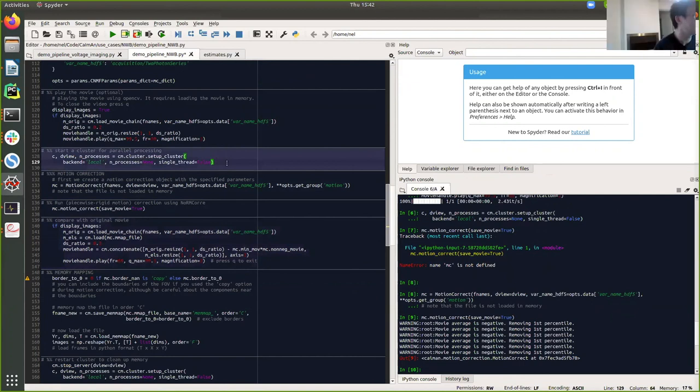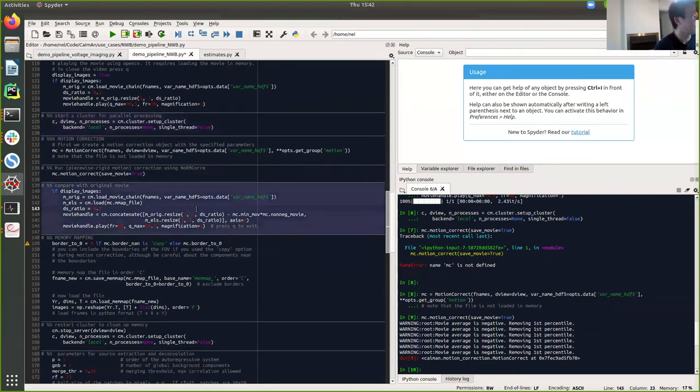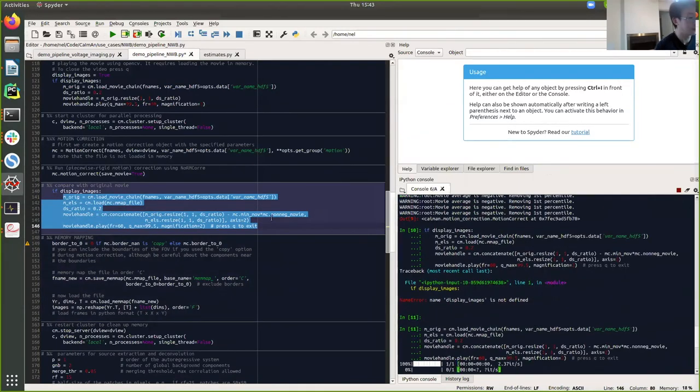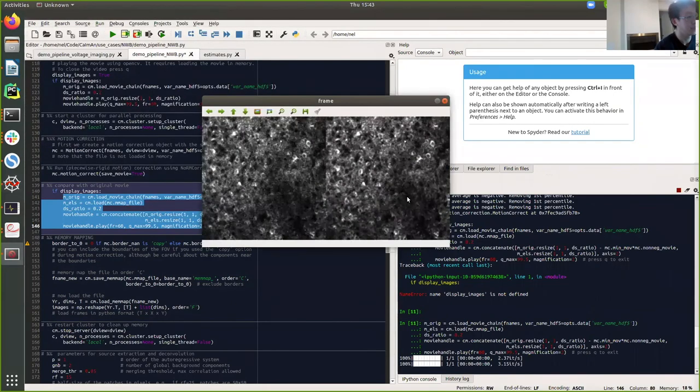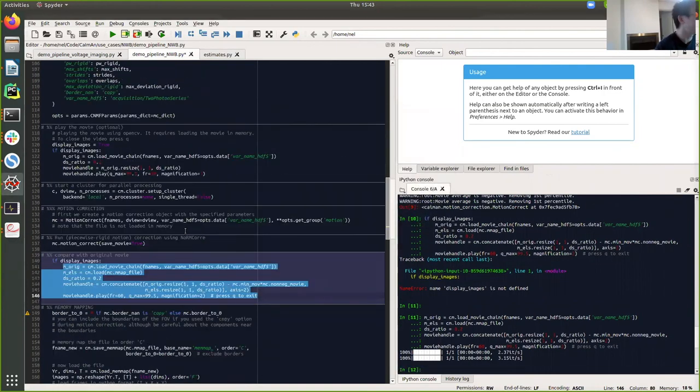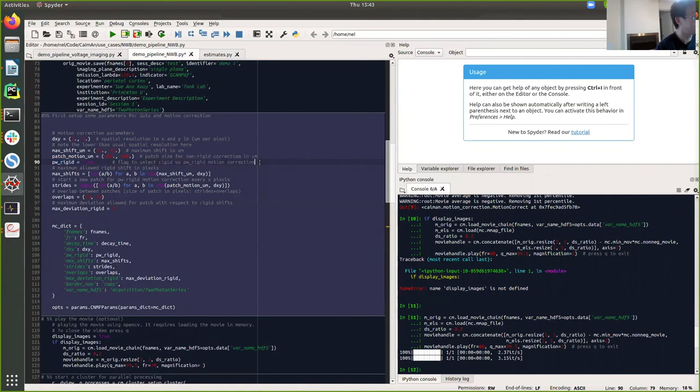The movie itself is pretty small, so it won't take much time. So the parallelization step is the step. We set up a cluster and we can define how many processes we want to use. And if you select end processes to be none, that means you use number of your CPU minus one. So if I have 16 cores, then we use 15 for doing parallelization. So here we want to see the result of motion correction. The left is the raw movie and the right is the movie after motion correction.